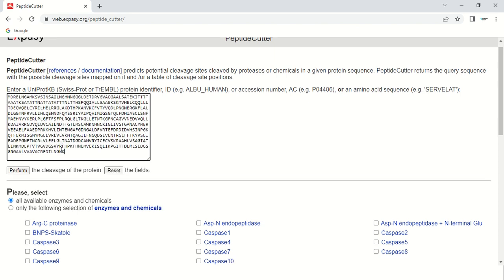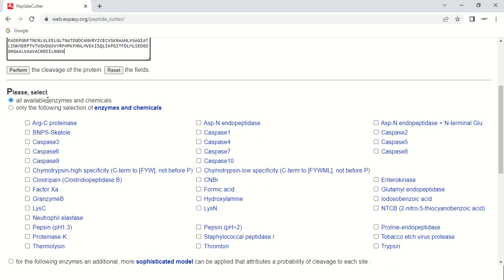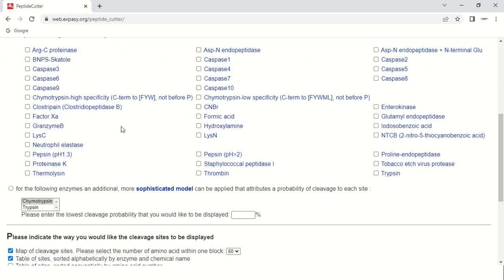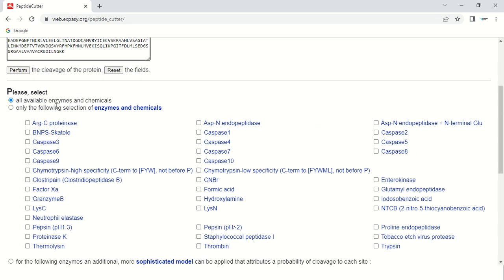There are certain options. The first is 'all available enzymes and chemicals'. If you choose this option, it will show you the cutting sites of all enzymes — there are important ones like Arg-C proteinase, and Caspases 3, 6, 9, and more. If you only want one or two enzymes, check 'only the following selection' and choose the specific enzyme. For now, I am going to perform the analysis for all available enzymes.